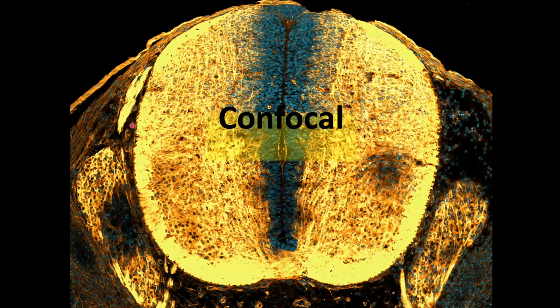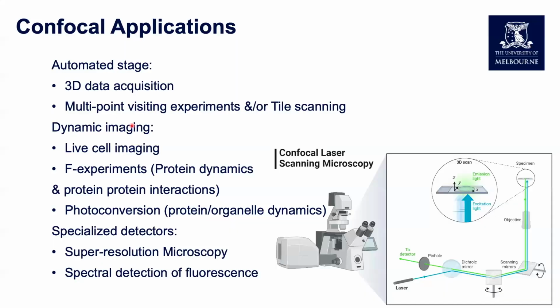Okay, confocal microscopy is one of the mainstays of our platform, and certainly of a lot of biomedical imaging platforms. There are a lot of functionalities here that we could be getting into. Primarily, people are making use of automated stage functions, so the ability to take 3-dimensional data by moving the focus, moving the sample in relation to the objective and building up that kind of 3D model.